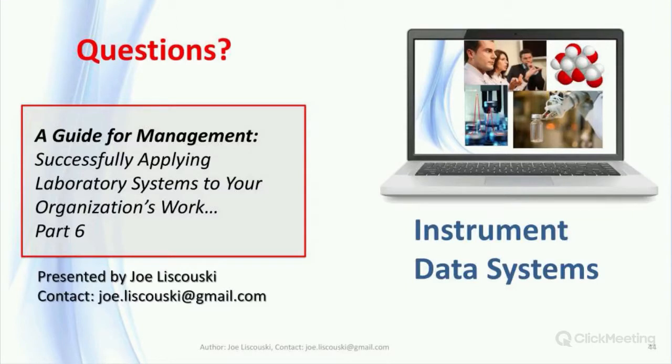The introduction of computer systems into laboratory science raises the bar on what it means to be a competent laboratory worker. That's true whether you're talking about management, lab personnel, or support. You can carry out science without computers, but in a competitive environment where productivity and return on investment have become important metrics, computers and automation are part of that reality. What that means is that we have to be well educated in both the science and the tools that are used to conduct that science.